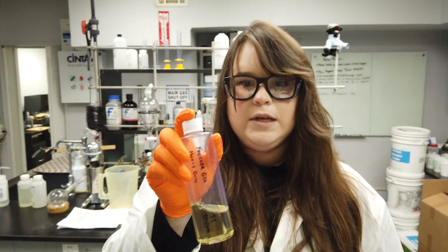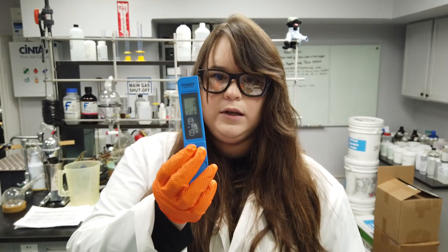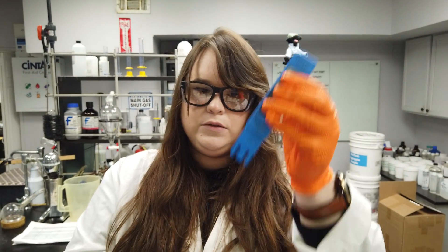In general, we're going to take our pre-mixed solution and make sure it's well-mixed in order to get a representative sample. For your conductivity meter, if you're using a stick-like unit like this, you will simply submerge the probe into your solution.